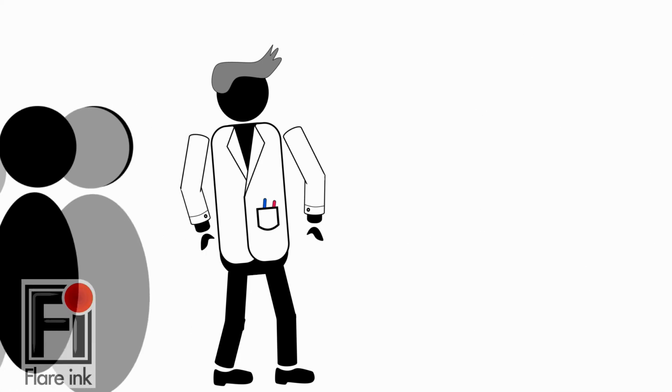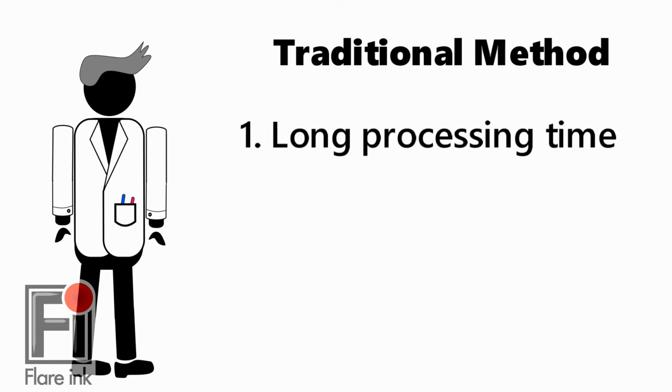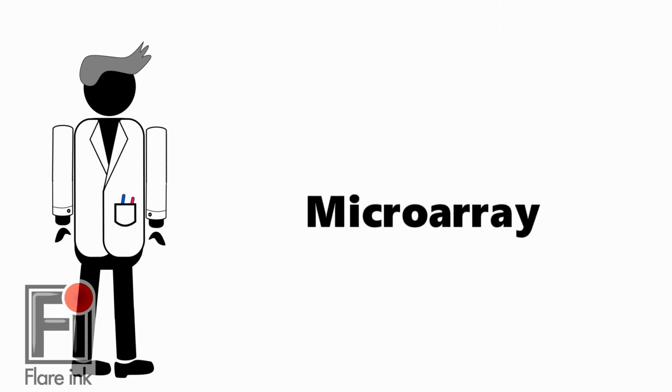But both of these approaches have a serious downside. The amount of time demanded for processing all these samples is way too long, and the amount of money spent on chemicals and talented workforce is too high to be justified. So how can we address these challenges without compromising the quality and the accuracy of your experiment? This is where microarray comes into play.